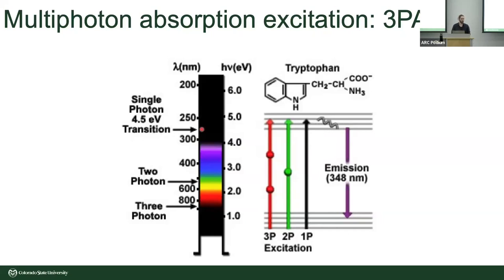That wavelength, of course, is very damaging to live cells. So if you're trying to illuminate with an ultraviolet laser or some sort of other source, you can induce a lot of photo damage to your specimen. Conversely, if you were to use green laser pulses somewhere around 520, 540 nanometers for their illumination, now we can do a 2-photon excitation of that same molecule. Green light is much easier to focus. Of course, there's optics designed for this. It's visible light, so we know very well that it goes right through glass with no problems of attenuation, and it's far less damaging to samples.